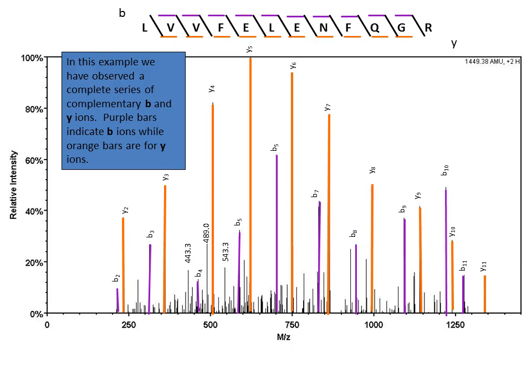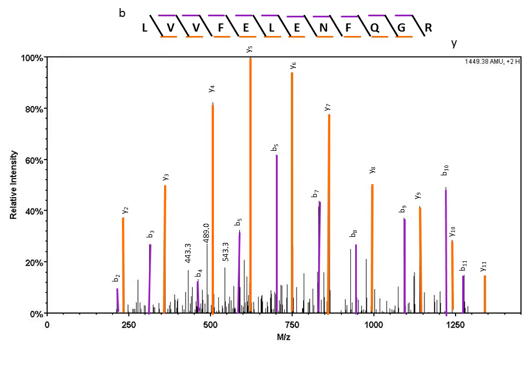When we work our way through the entire spectra, we should be able to assign all of the major mass ion peaks in the spectra. What we've described here is the determination of the sequence of a peptide by de novo means, or without any prior information. Once the number of fragmentation spectra exceeds 10, de novo peptide sequencing becomes a little impractical. In another presentation, we will discuss how search algorithms can use databases of protein sequences to determine the sequence of a peptide in a spectra.